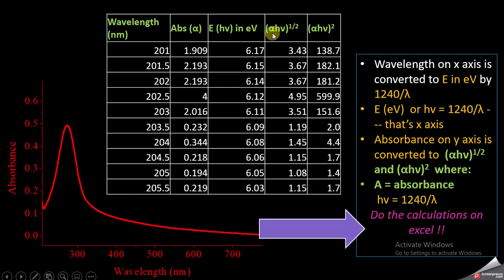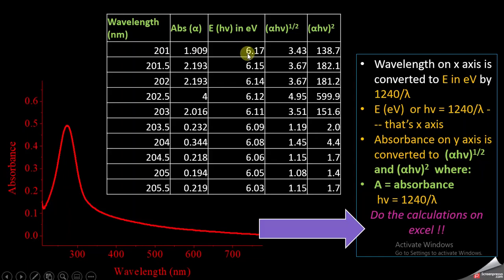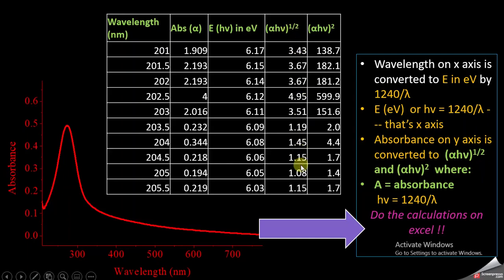The second thing is to get the parameter alpha·hν raised to power 1/2. You can obtain this parameter using the absorbance. Alpha is actually the absorbance value — you just multiply this absorbance value with the values of hν in electron volts and raise it to the power of 1/2 to get alpha·hν raised to power 1/2. You convert all these absorbance values into this parameter and you get this column.